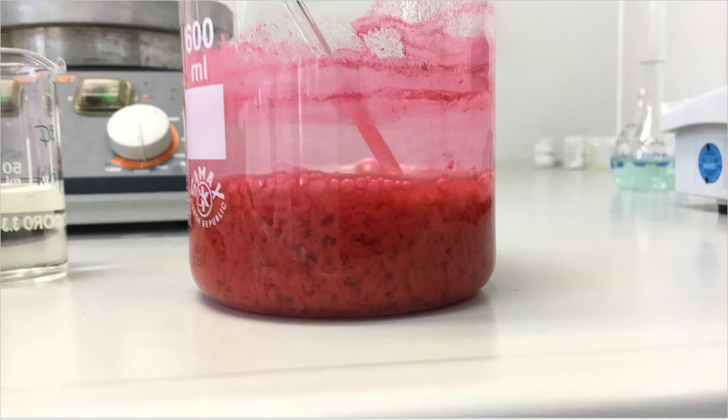This is what you're looking for, folks. This is the nickel DMG precipitate right there. It's going to be reddish pink, maybe fuchsia. The solution above on the top will be clear. It might slightly be pink, but your precipitate will be reddish pink on you. If you see this, that means that you probably have done a very good job.